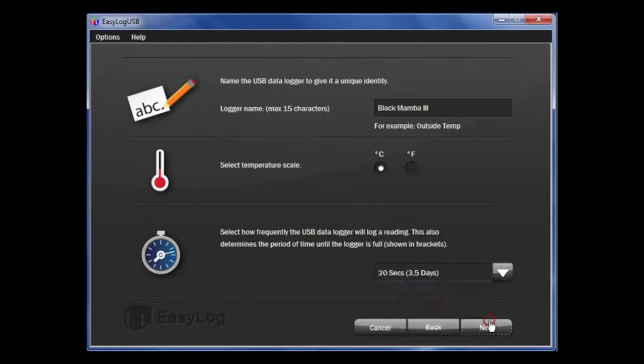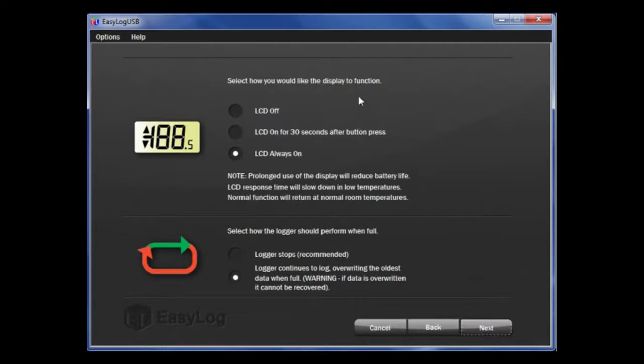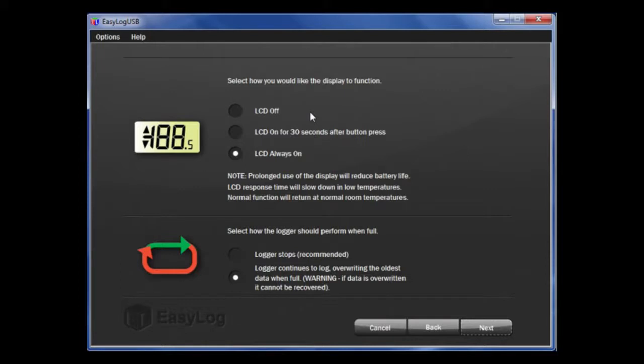If you have a data logger with the display, you have a few options relating to the display. Firstly, how often do you want to look at the display? You can choose to have the LCD off, on for 30 seconds after you press the button, or on at all times. Choosing to be economic with the use of the display will improve the battery life of the logger.